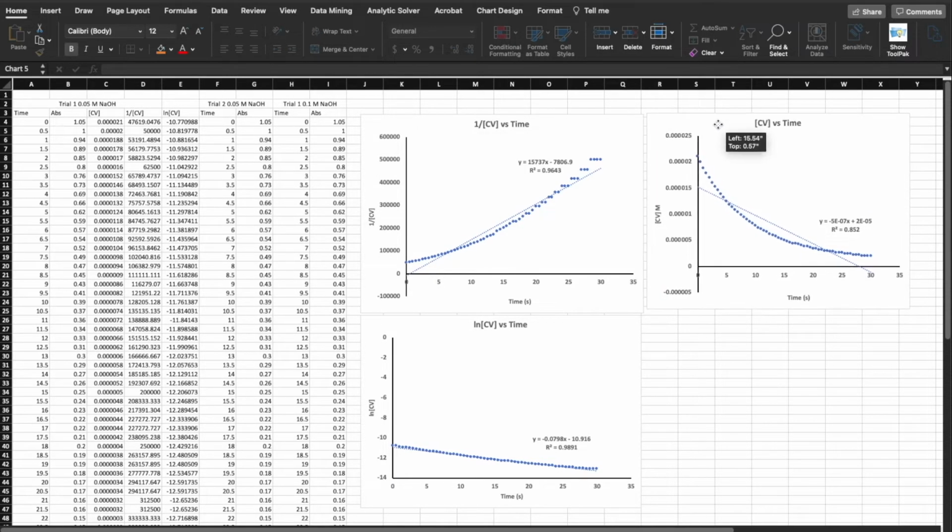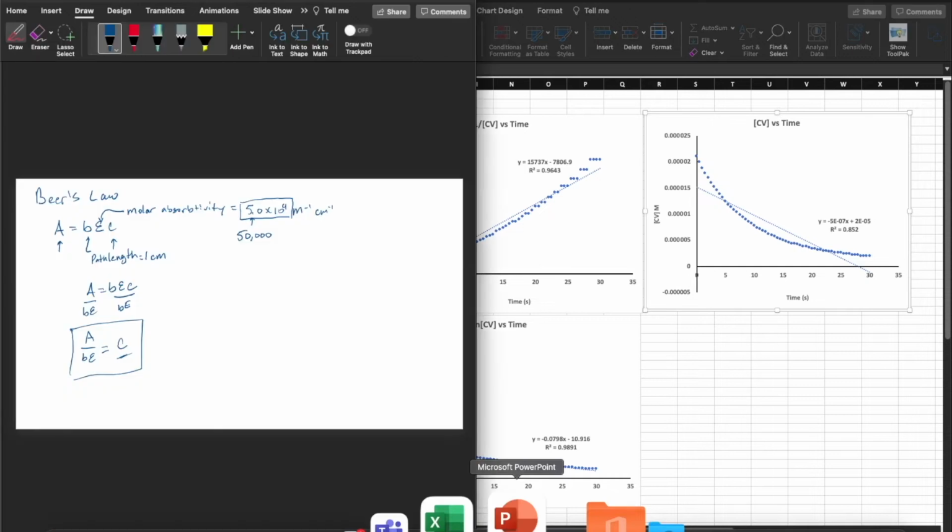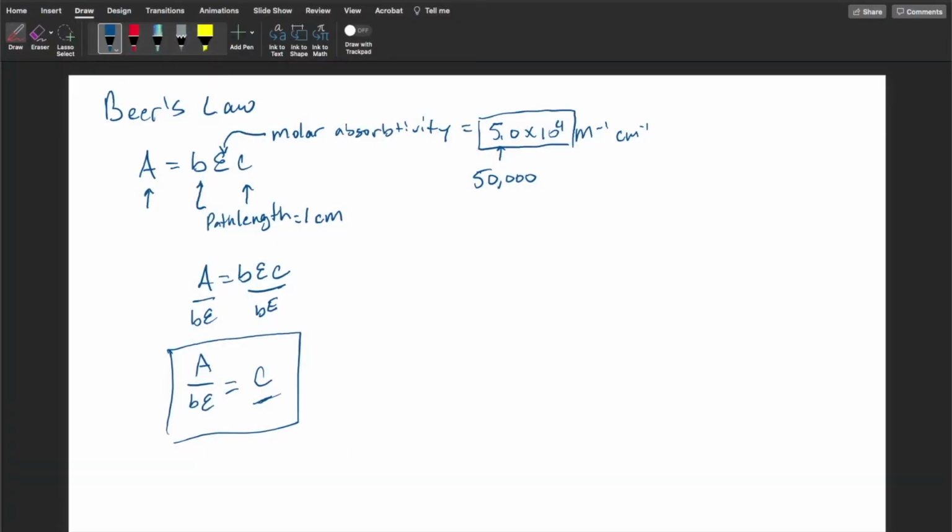So now that we've done that, we need to go through and figure out how to complete some of the discussion questions that are at the end of the graph that will help you actually write the discussion section of your report. Okay, so to do that, this is a lot of work, so I'm going to go ahead and save this here. Saved. Okay. And then I'll bring back up the whiteboard here. We'll maximize the whiteboard, like so. Okay. And I'm going to go ahead and delete all this stuff here because we don't really need it anymore, I don't think.